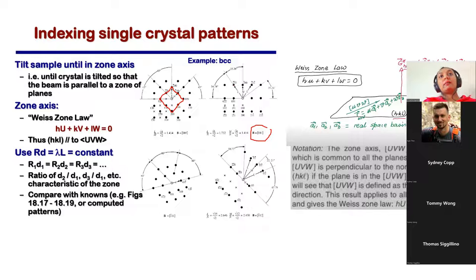For 011, it simply looks like a central point here. And you see that from the central point, we got two distances. One is your distance L here, another is this distance here, and one is your M. So by this, you would know the values of different vectors that would help you create the entire diffraction spot pattern for different analysis. And you would be doing that. So how does the shape of the 011 zone axis for BCC look? Guys, this is where everything in microscopy lies. It looks like this. And this pattern would be repeated.